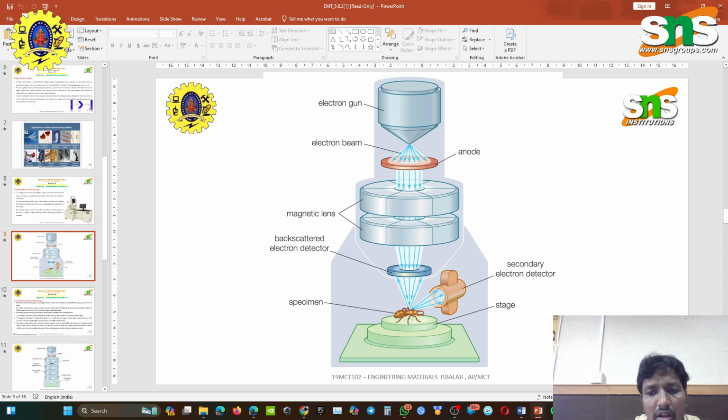So why do we use electrons instead of a light microscope? Given sufficient light, the human eye can distinguish between two points spaced 0.2 mm apart without any aid of additional lenses. This distance is called the resolving power or resolution of the eye. An assembly of lenses, a microscope, can be used for magnifying the distance and enabling the eye to see points much closer than 0.2 mm.